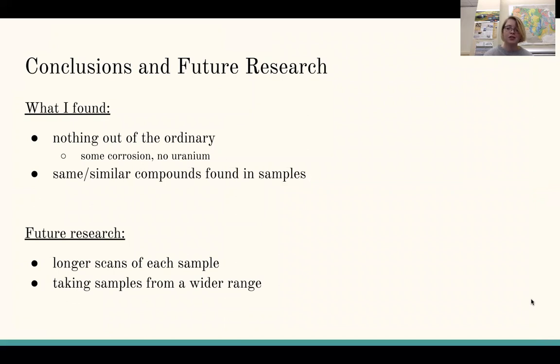So in conclusion, after taking samples out of my family members' backyards, I found really nothing out of the ordinary. There were some minerals that I didn't recognize and had to do some research on, but a lot of the compounds present stayed relatively the same from sample to sample.